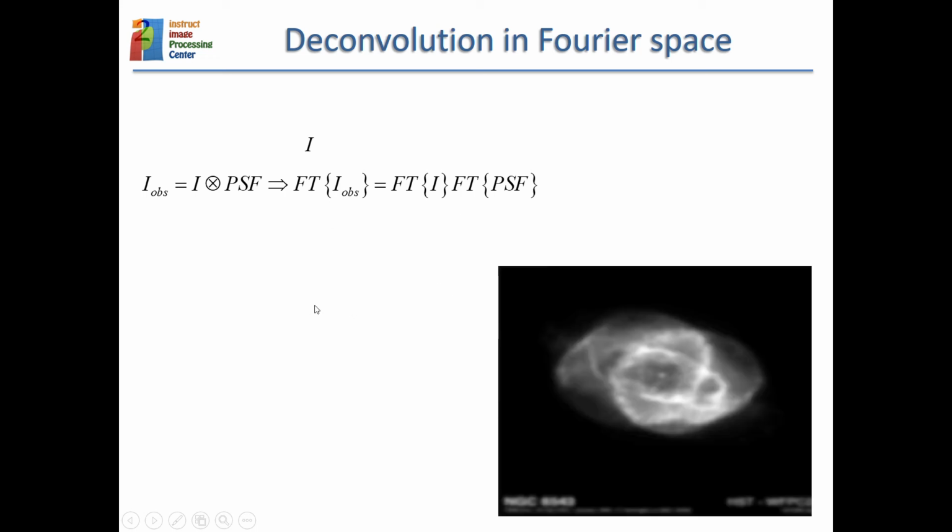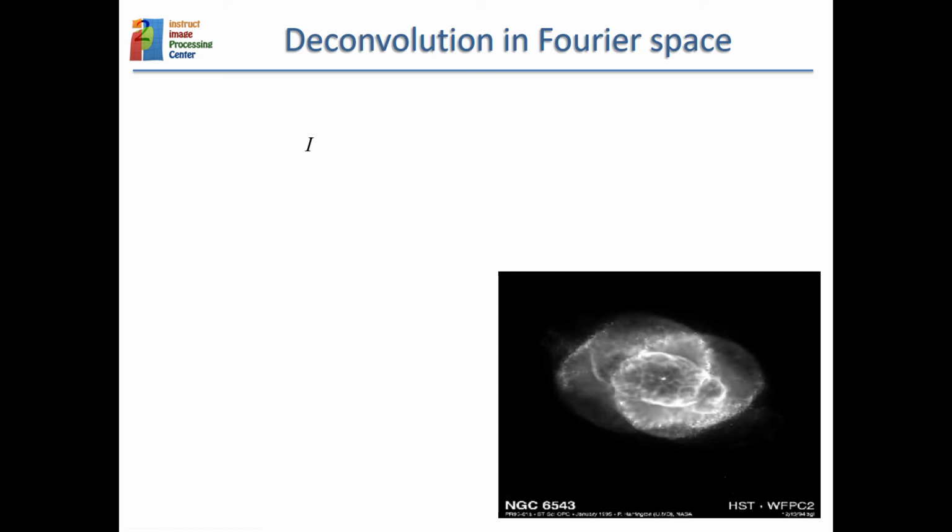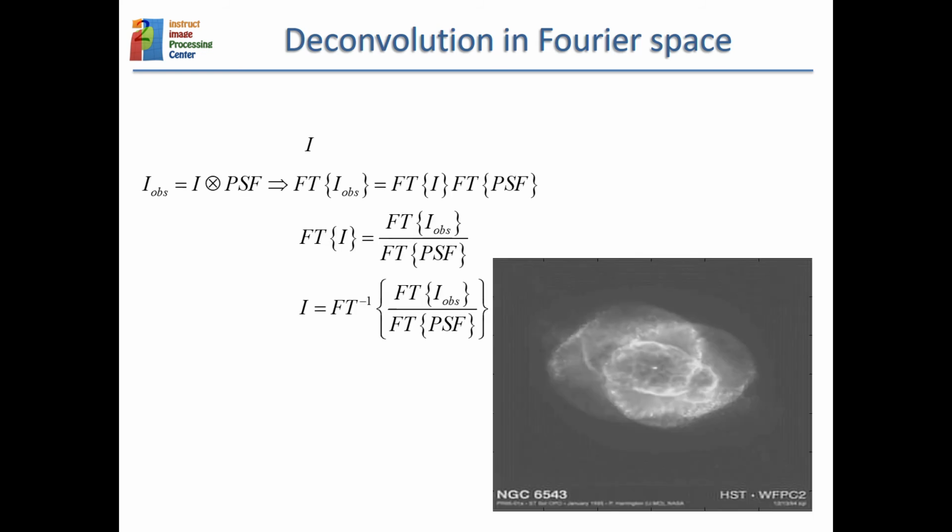So it is not exactly the same as the original one, and the reason is that we have not accounted for the noise, and maybe our model of what were the aberrations is not perfect. But otherwise, it is a much better estimation of what the ideal image looks like.